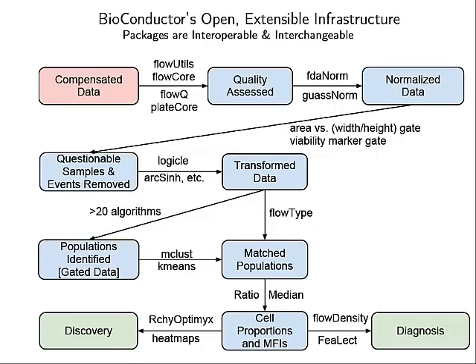So yesterday, we walked through and got you up until data transformation, I think. So now we're at the next step of looking at what we can do to identify populations. And then once you have those populations, there are a couple of different tools you can use for diagnosis and discovery.